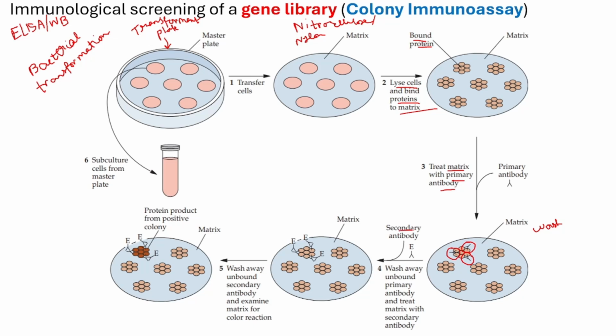So these are the secondary antibodies E, which have been bound to the primary antibody C. The primary antibody binds to the protein, and the secondary antibody binds to the primary antibody. So these are the places. See, there are 2 antibodies. Okay, then you again perform a washing step to remove all the non-specific bindings. There may be other secondary antibodies which did not bind but are present, so you remove them.